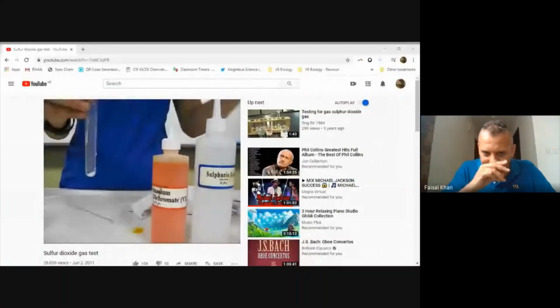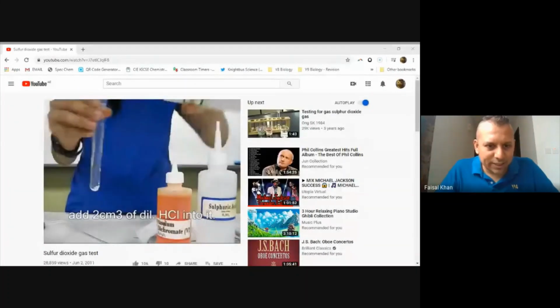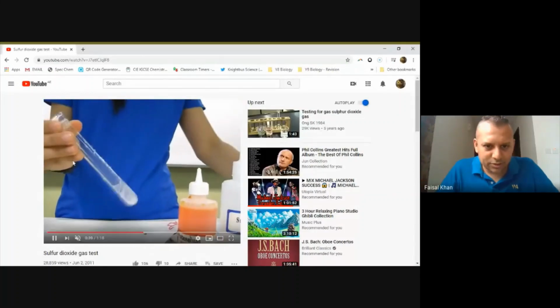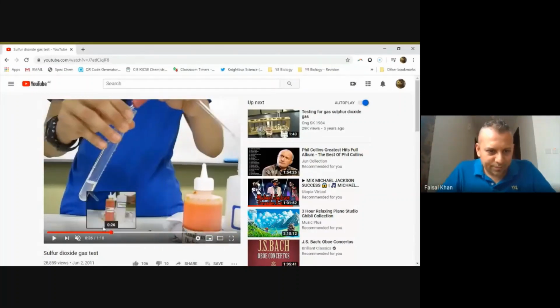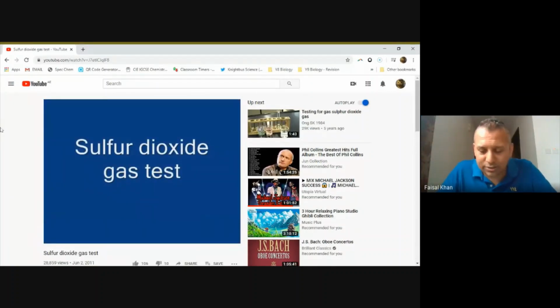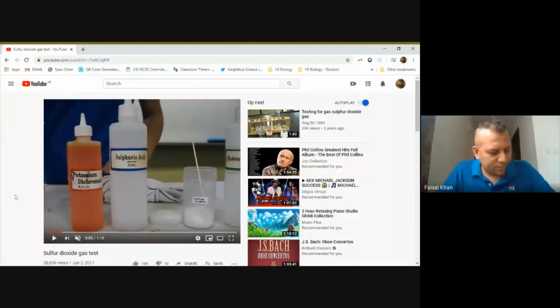So you should now be seeing chemical test for sulfur dioxide. Now this was the link that I sent through the classroom. Okay. So this was on the quiz. So let me just explain this to you. I'll just pause it and I'll just flick through it. Okay, so there's a sulfur dioxide gas, another gas that you need to be aware of. Okay, so you start off with two chemicals. One is called potassium dichromate, and the other is called sulfuric acid, right?